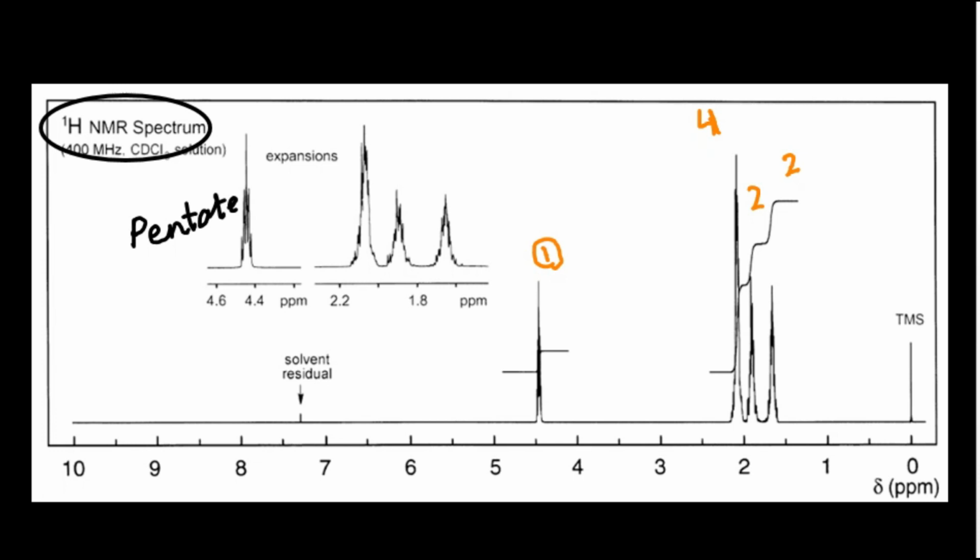The chemical shift value also tells us that this is the carbon attached to the bromine atom, because only the bromine atom is present that is electron withdrawing in nature in your compound. So one hydrogen is present that is attached to the bromine. Why one hydrogen?